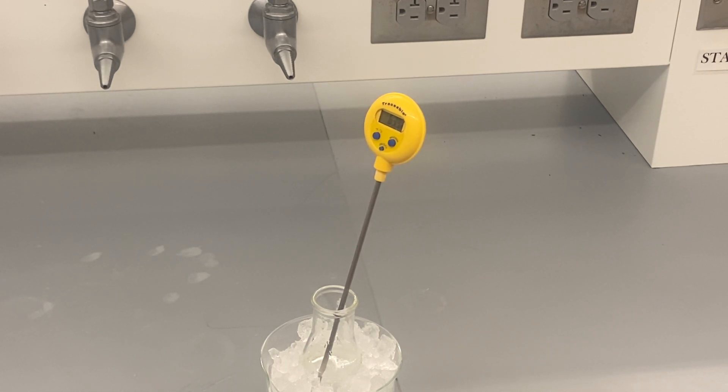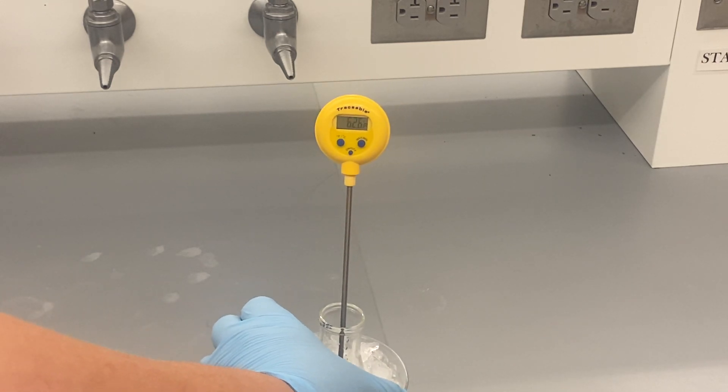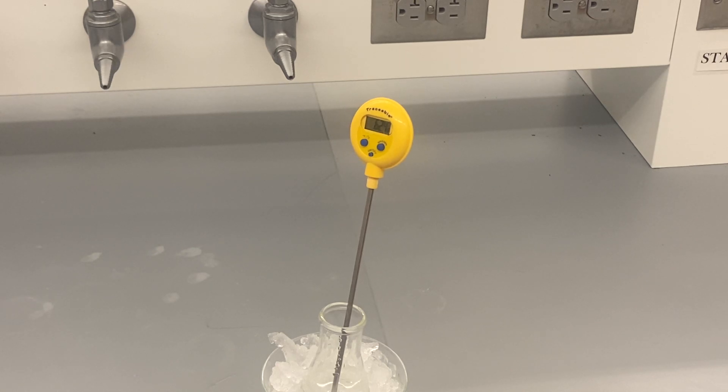In fact, if you have a solution that has two different solids dissolved in it, and those solids dissolve at different temperatures, this might be a methodology to get one of the solids to re-solidify while the other still remains in solution. There are also certain chemical reactions that are going to work a little better under a slightly lower temperature. We see here that's already down to almost 62 degrees Fahrenheit after just a minute or so of sitting in the ice bath.